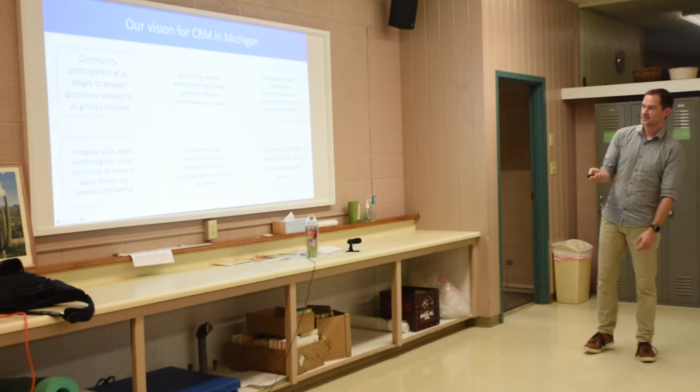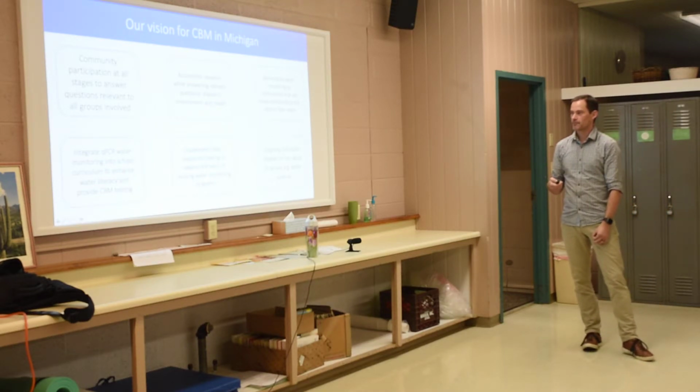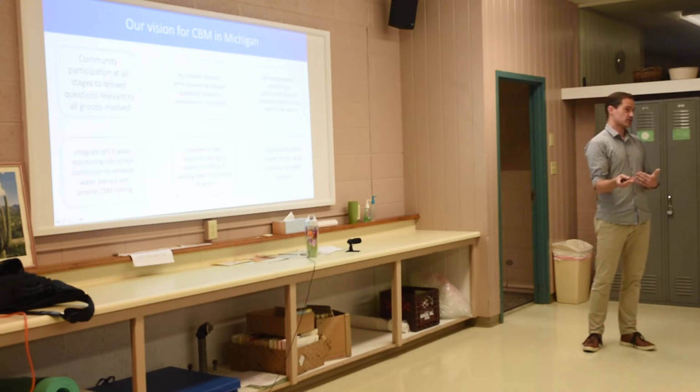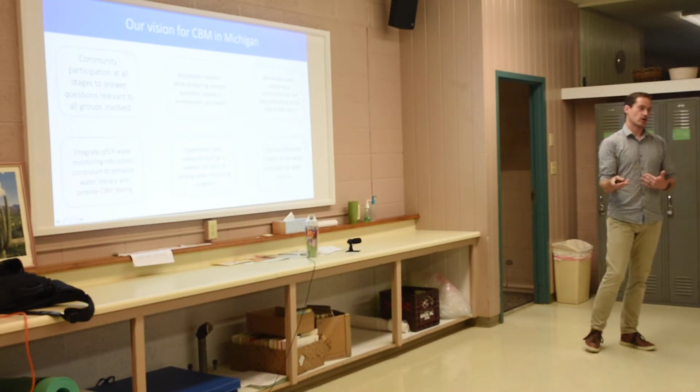We've partnered with a group called Inside Education in Alberta to do this, and our plan is to try to have about 20 qPCR machines in schools in Alberta next year so that we can run CBM programs for water monitoring through schools.